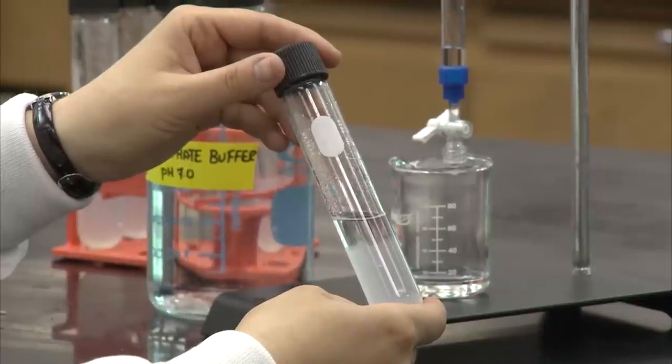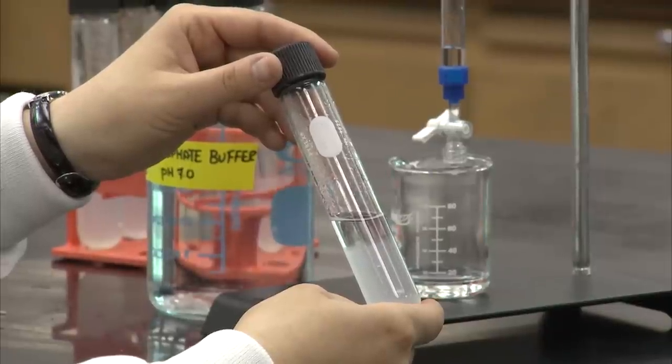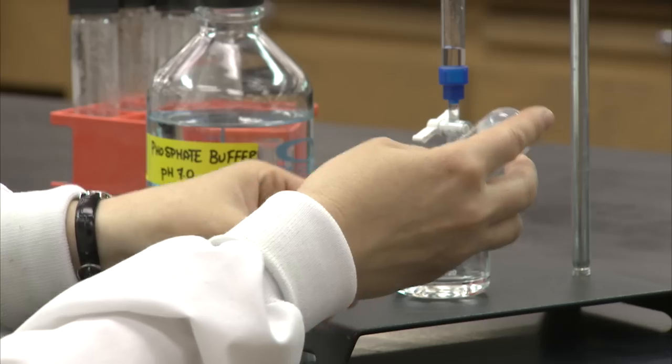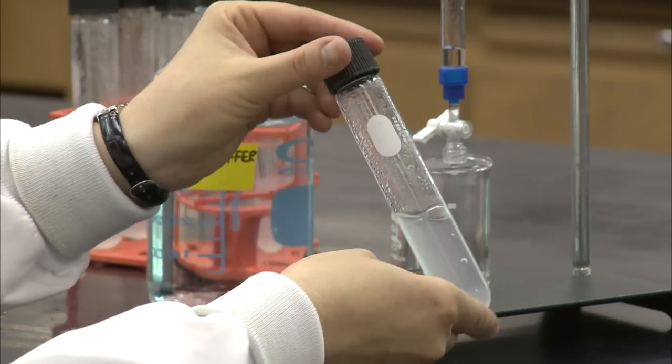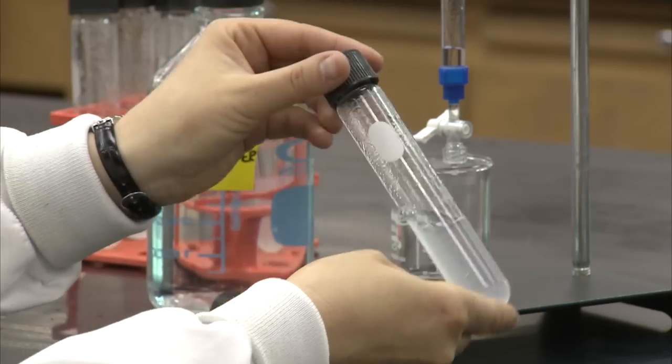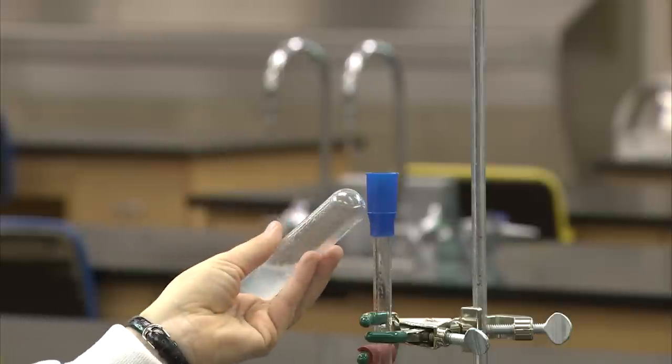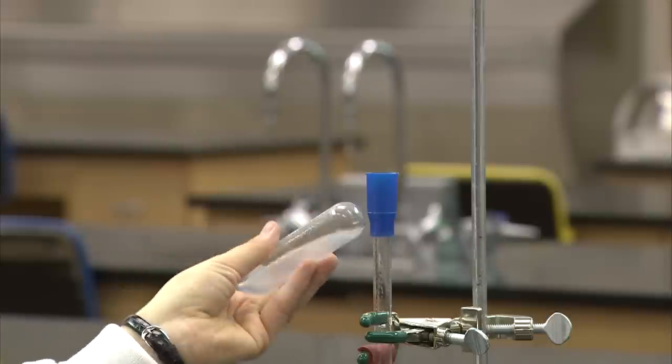As the gel settles in the buffer, it must be mixed to create a slurry. But you must be careful not to introduce air bubbles or damage the gel beads, as they could negatively affect the experiment. Keep tilting the bottle back and forth until there is no gel stuck to the bottom of the tube.